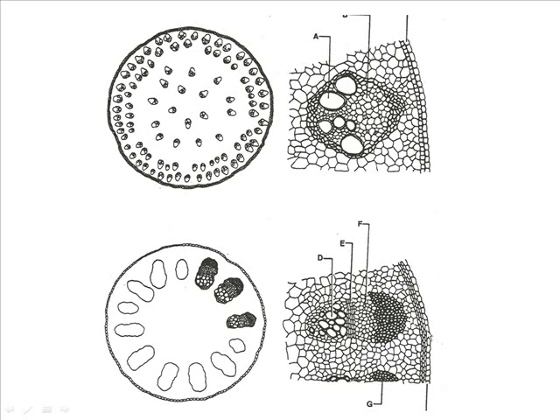Yes, down to our dicot stem. A lot of the same things. On the outside, we have the epidermis. Just inside the epidermis, a few layers of a tissue called what? Collenchyma. Then we have the vascular bundle here. This would be what, here closest to the outside of the stem? Sclerenchyma.